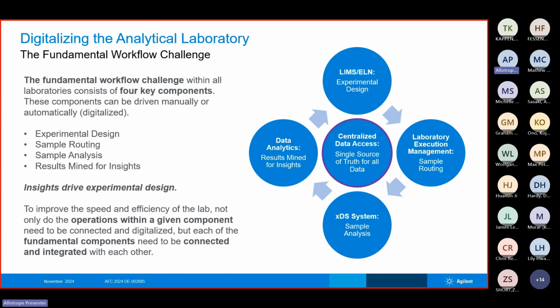There was a lot of discussion today with regard to certifying whether your hypothesis is correct by doing a wet lab test. And I think, with optimizations with our AI and ML models, that is going to be the paradigm in the future. It will be as simple as somebody just feeding a vial to some kind of input system, if it is in a discovery phase. They just feed that into a window, and the robotic arm comes and picks it up, and it's all lights out. You are notified when your test of interest is actually completed.